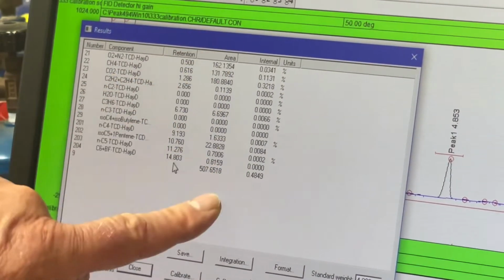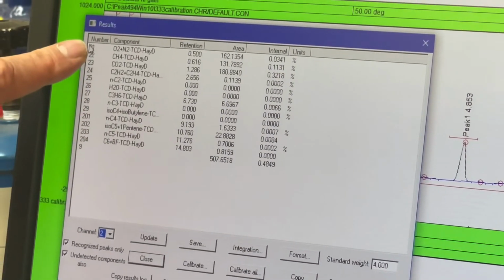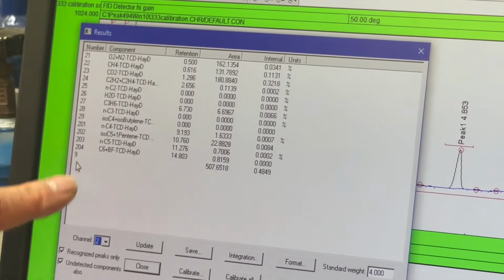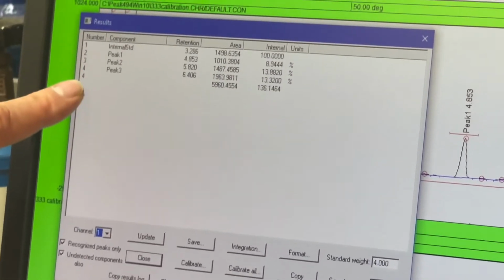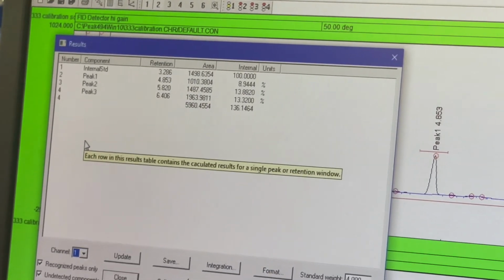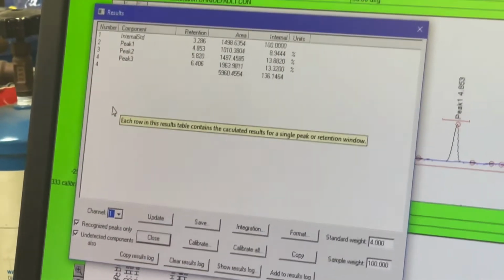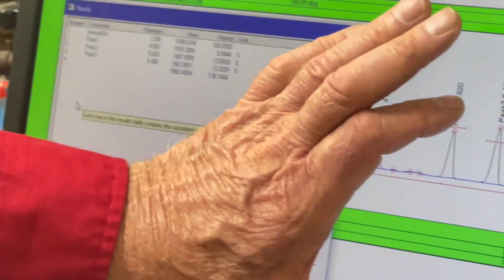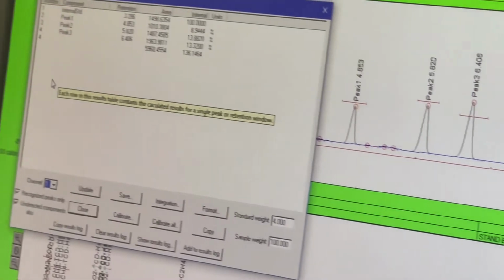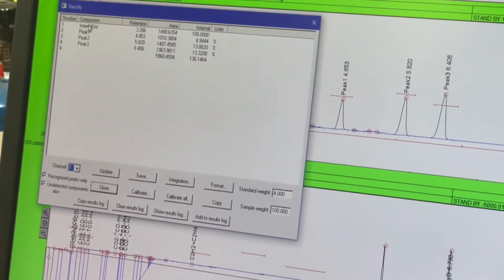You can see that there's quite a bit of peaks. Most of them have zeros, but that doesn't matter. What matters is the peak number, right? Notice the peak number here starts with 2. They're all 2s, whereas in channel 1, we're just starting with 1, 2, 3, 4, right? So it's important to have different peak numbers in channel 2 and channel 1 in order to make this merging work, because if there are peaks that have the same number in channel 1 and channel 2, PeakSimple adds those numbers together, and at least for this case, we don't want to do that, right?